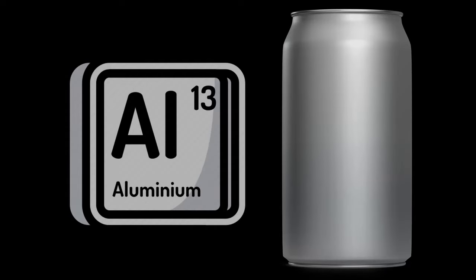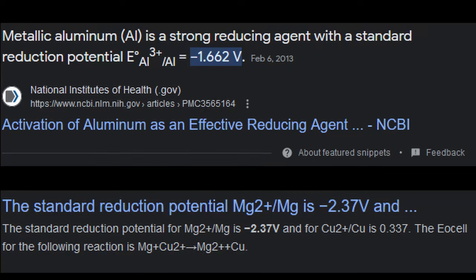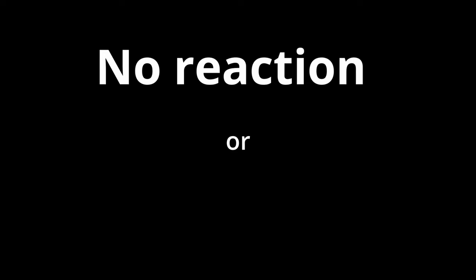The next metal I want to try is going to be aluminum, which is going to be in the form of a powder. Aluminum is actually significantly less reactive than magnesium — about 43% less reactive going off the redox potentials. This means that we should expect either no reaction, if that potential is not enough to pull the oxygens away from the carbon, or we should still see a reaction but it may not be as vigorous as the magnesium.